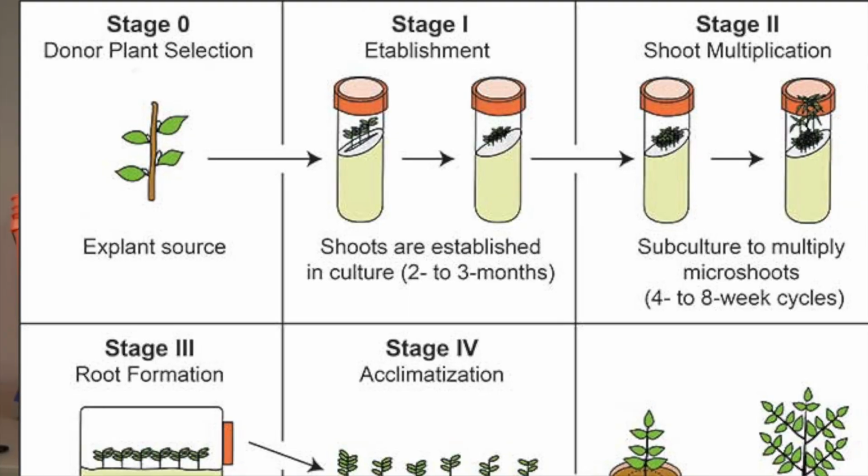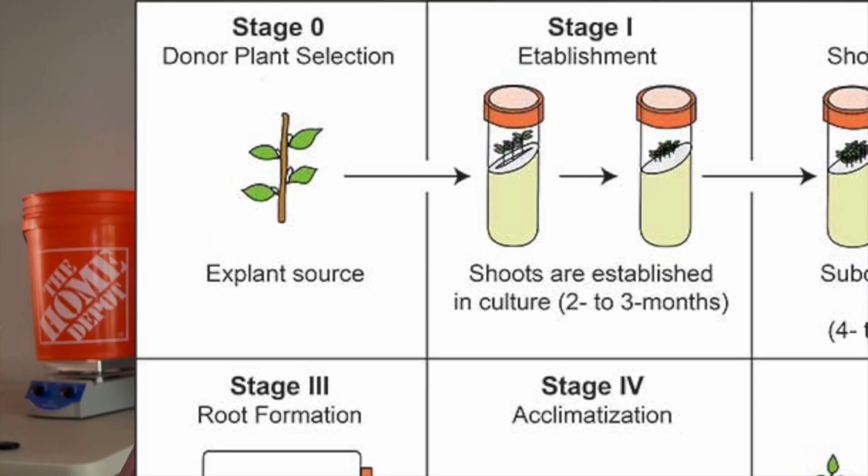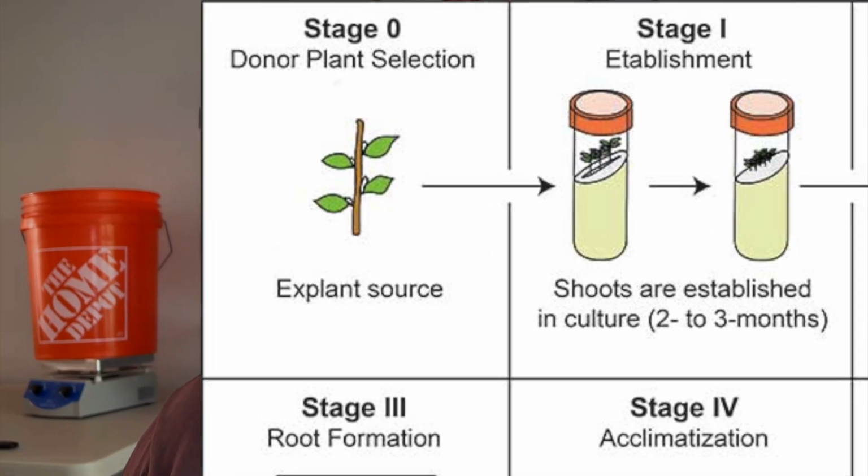Alright guys, so to start us off, we got to talk about stage 0. So this stage is often very much overlooked, but that ends up being a problem down the line, especially when you want clean materials, clean plants. And so at this point, your plant material is being grown out normally, which is in a greenhouse, out in the field, out anywhere, not in an aseptic vessel.